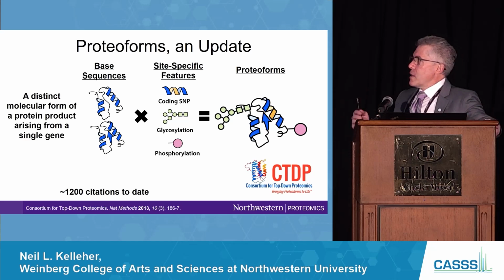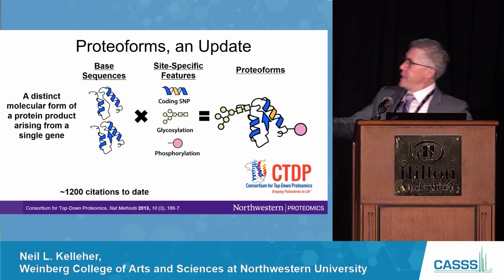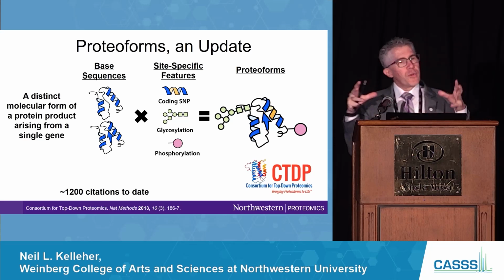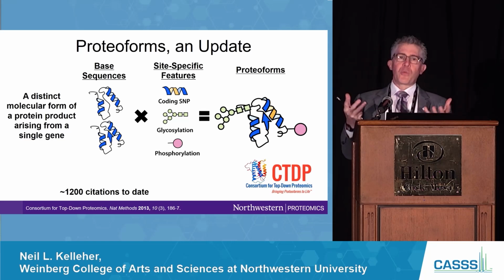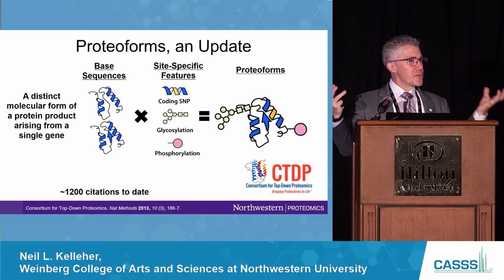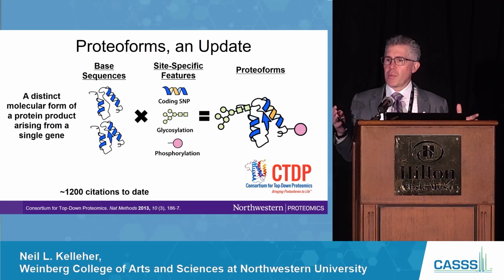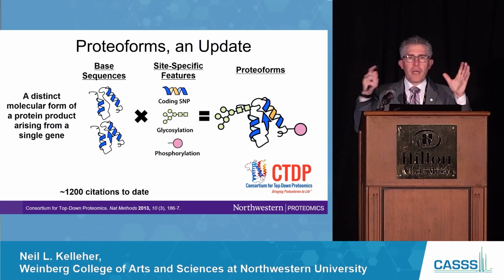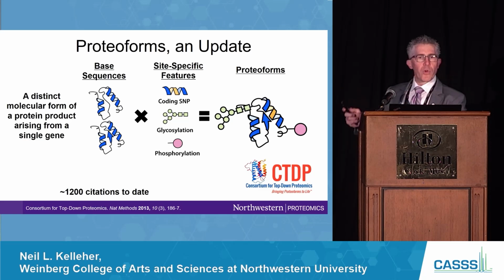And so we said, okay, protein variants, charge variants, isoforms, PTMs, polymorphisms that are encoding regions or mutations, combinations of post-translational modifications, all the sources of variation in the primary sequence and structure of a protein. This is what the word proteoform was born to describe. It traces back to a single gene, and so there is no inference problem. There is no problem of making peptides fit into, it eradicates that, solves that, and so that's what it's meant to convey. And it's not just a word, it's a movement.